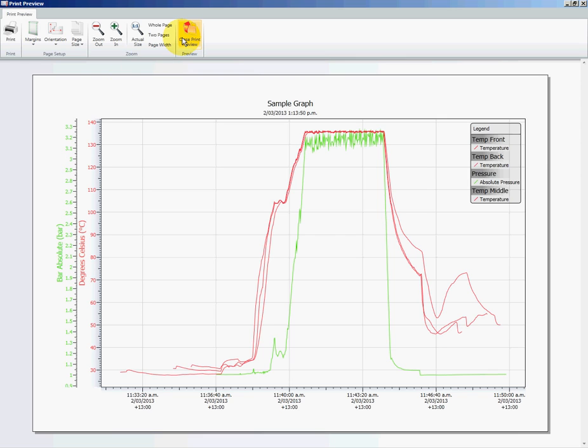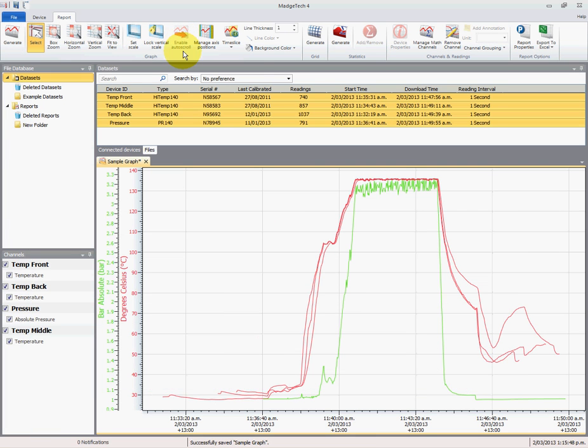In the older versions of software we didn't have a legend available and there was a bit of work involved in creating all this. So we haven't had to change anything.